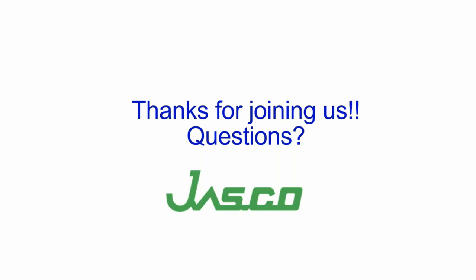Let's see. How to analyze excitation emission map. Can you give any suggestions on that? I can probably talk a little bit more about that offline, but can say an excitation emission map is really a 3D spectra, right? Where I've taken emission scans at different excitation wavelengths and basically get like a 3D plot.